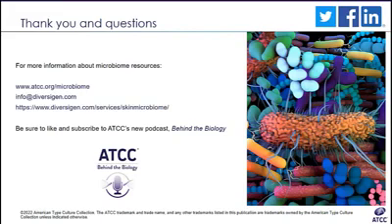Okay. Now you talked a little bit about some of the disadvantages. Where are the particular use cases or case studies where full-length 16S sequencing is seen to be advantageous for skin microbiome sequencing?